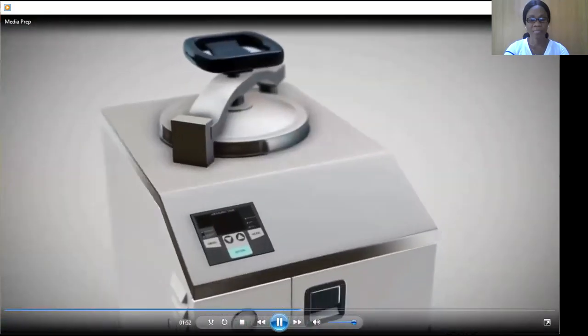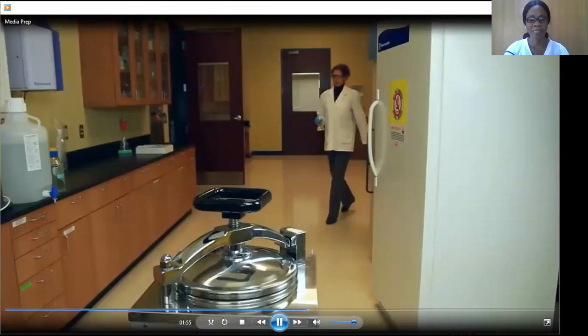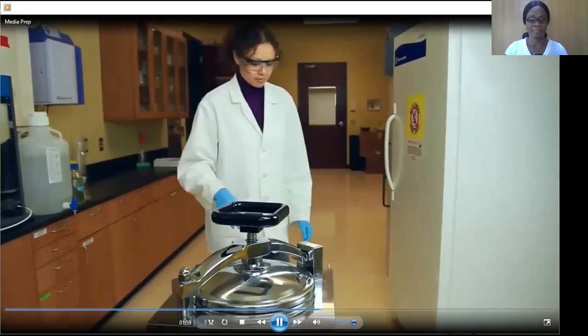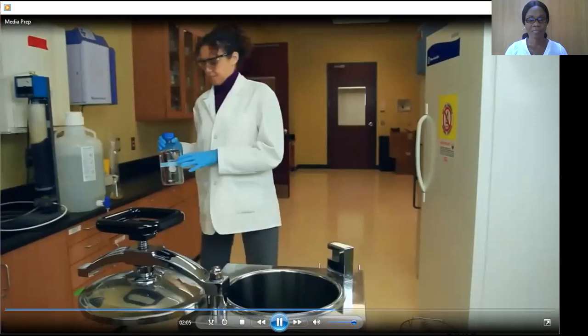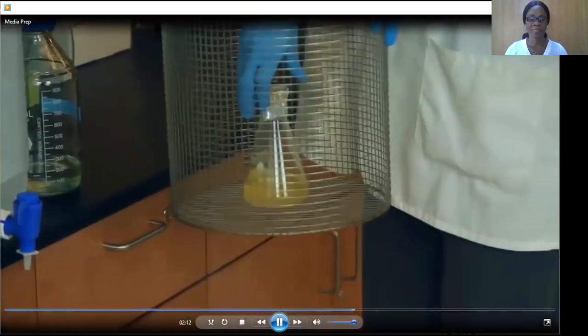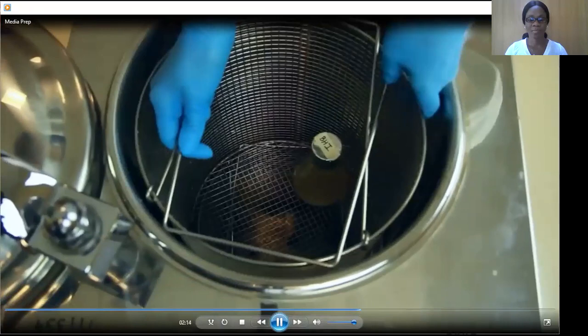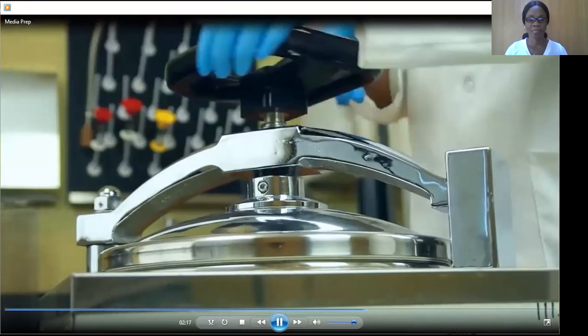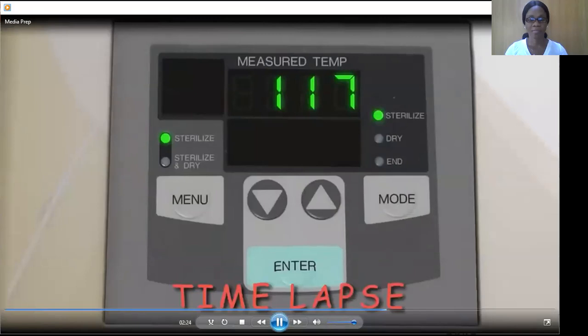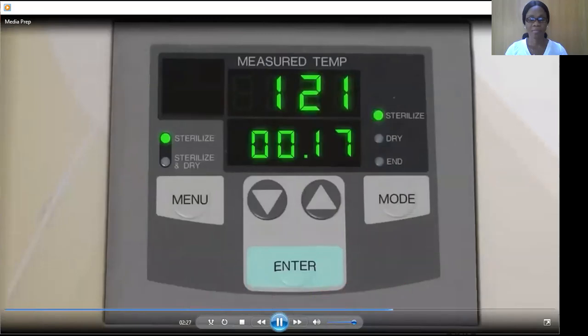Next, use the autoclave to sterilize the media. The heat from the autoclave will also help the agar to properly dissolve in the water. Power on the autoclave and make sure the drain valve is closed. Add deionized water to the level indicator line. Place the flask of culture media into the basket. Insert the basket, close the lid, and turn the handle to create an airtight seal. Use the control panel to set the mode to sterilize, the temperature to 121 degrees Celsius. We'll run this cycle for 17 minutes.